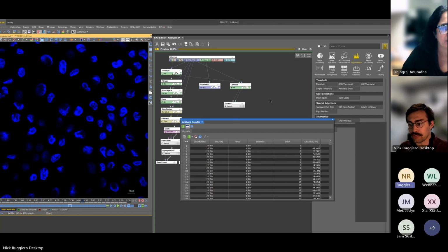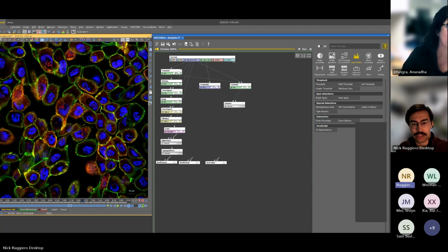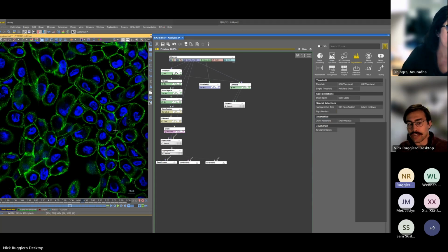But there's probably a couple different ways we could go about it, because we have a lot of channels that we can use here. Like for instance, this channel looks like it's going to be a really good segment, but because they kind of touch, which is sort of going to be inevitable for what it looks like for the sample type, we'll have to delineate these as individual objects first. But there's a number of ways that we could do that.